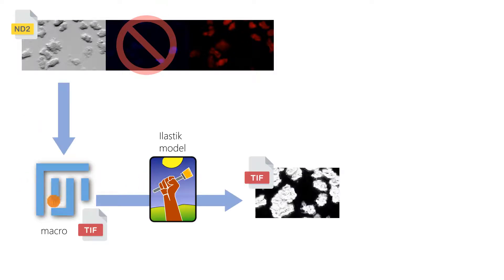So we're going to run it in Fiji, we're going to use a macro to export the TIFFs. Ilastik doesn't take in all the different file formats so this is one of the occasions when I would recommend to export to a TIFF. Ilastik, maybe something like MATLAB, might be easier to use TIFFs as well. So we're going to write that macro, export to ilastik, annotate a basic model there and then generate these probability maps of the areas of the cells.